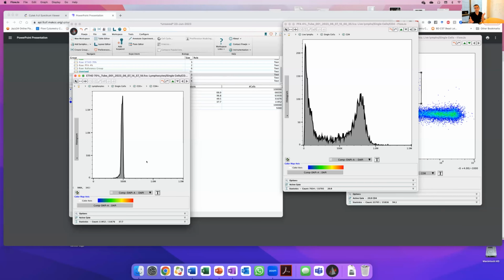And so there's always a balance, right? Ethanol is great for this reason, but then you have to be careful with the dyes that you use. So if you avoid any fluorescent proteins, you should be okay to use ethanol. If you have GFP cells or mCherry, etc., then the best approach would be to use PFA. And again, you should really optimize your protocol.